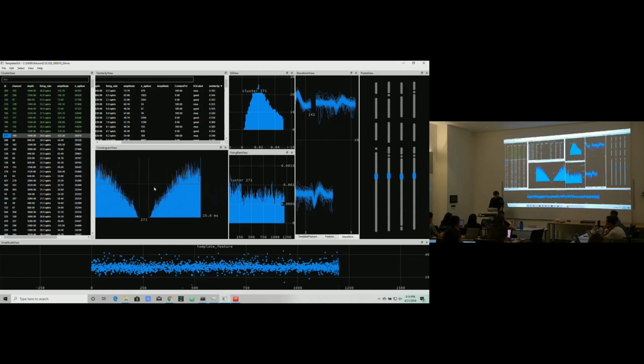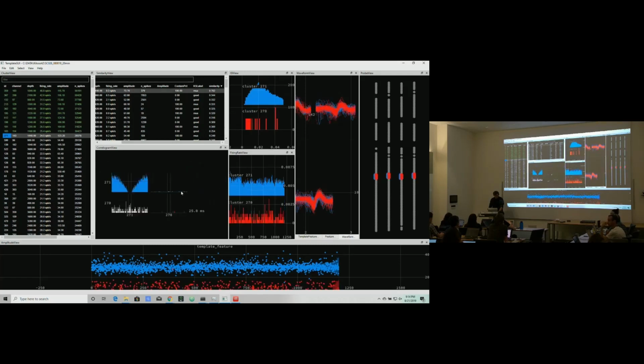Let's forget about it. Would you be able to cut it out with PCA? Well, the thing is that these two spikes are doublets, so their main distinguishing feature will be that they happen very soon, one after the other. So they'll almost correspond to the exact same waveform.